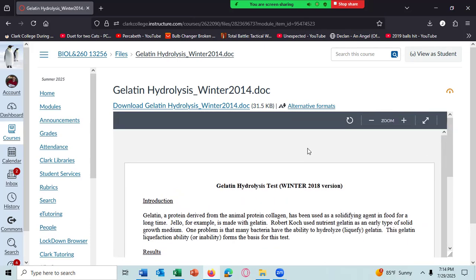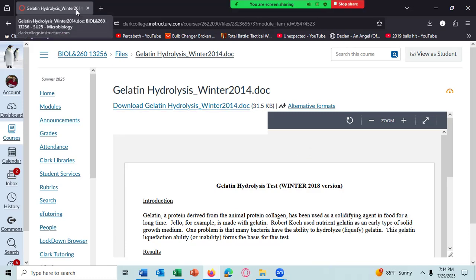So if you take a test that takes a long time, don't be expecting the results right away, and don't send me an email saying, "Where are my results? I asked for it 4 days ago." For example, if you request the MR test, you're not going to get any results until 5 or more days after you request the test. The gelatin hydrolysis is the longest, it's 7 or more days.